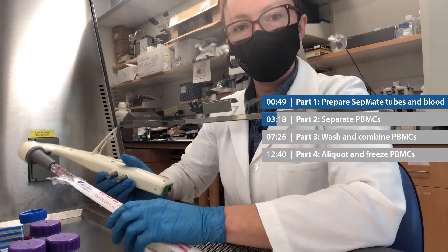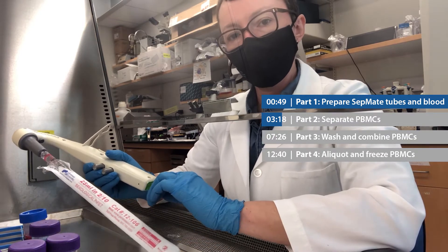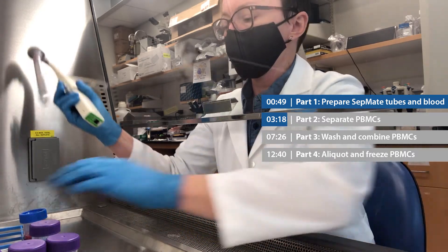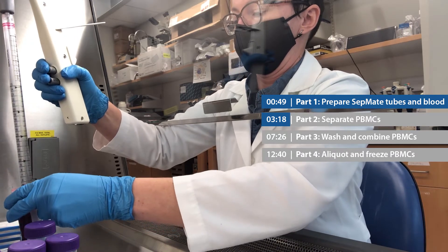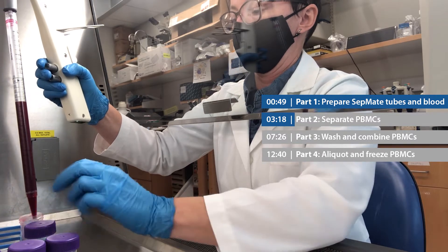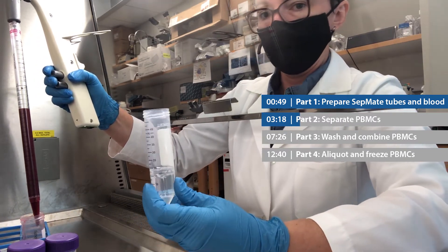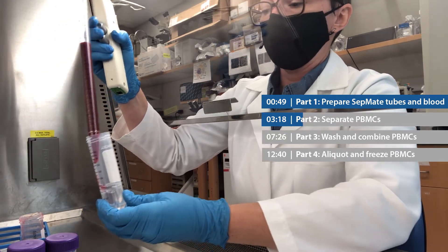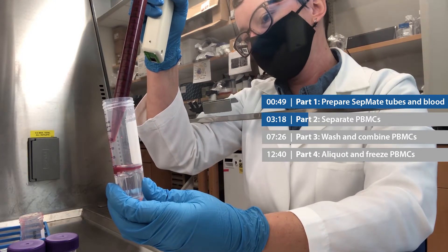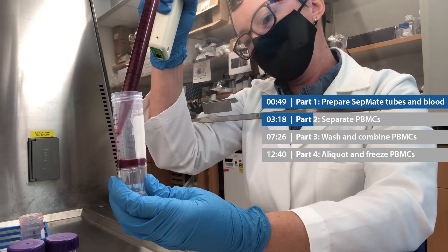What I'm going to do is very carefully drip 20 ml of the diluted blood down the side of that SepMate tube, and it's going to sit on top of the lymphoprep media. Let me show you. I'm going to put my pipette tip on the side of the SepMate tube, and I'm just going to slowly pipette down the side of the tube, and the blood should stay on top.